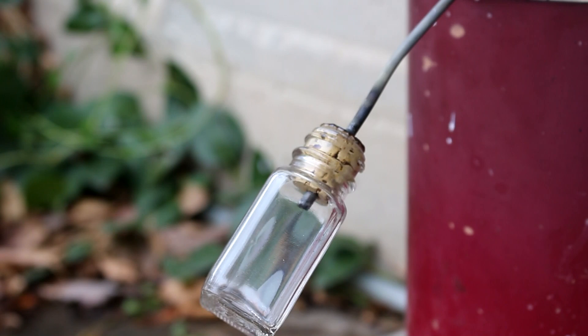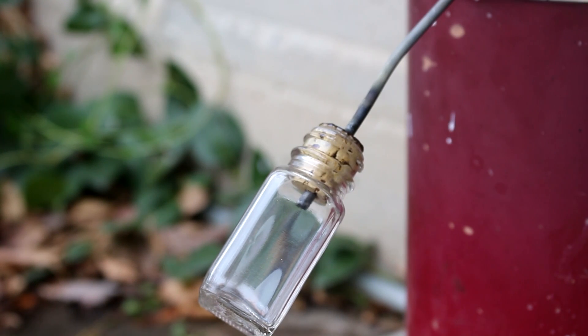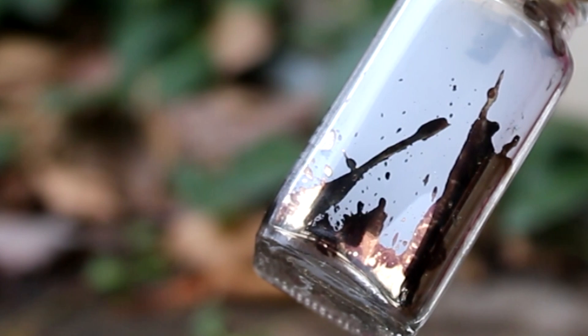Looks like not much has come out. Let's try warming up the metal tube here and see if we can get the cesium to flow. Maybe because it's a cold day, it's not coming out. Oh dear, something came out. And look, it's gold colored. That's cesium.